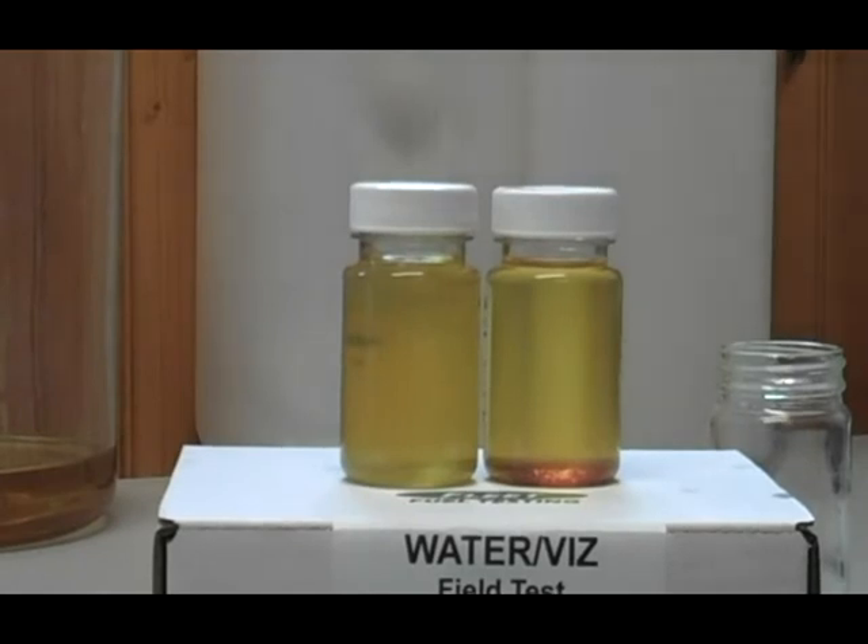This test picks up water in the range of — the detection limits are between 200 and 500 parts per million. Importantly, this test does detect suspended water, which many of the current methods only detect water that has settled out to the bottom of a fuel sample.